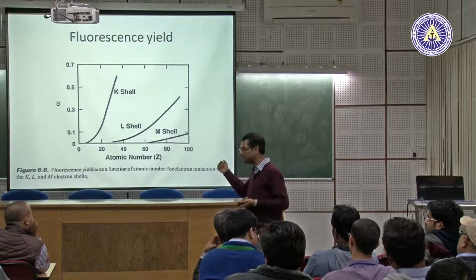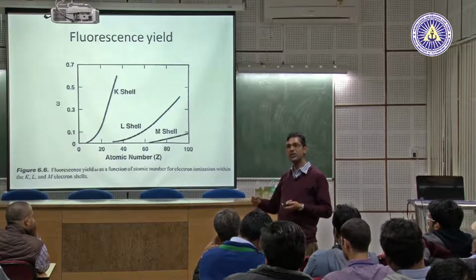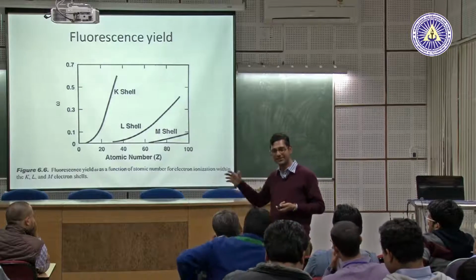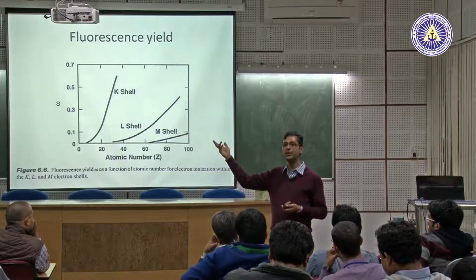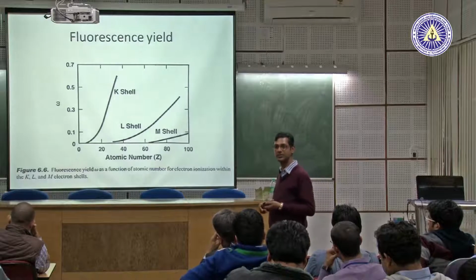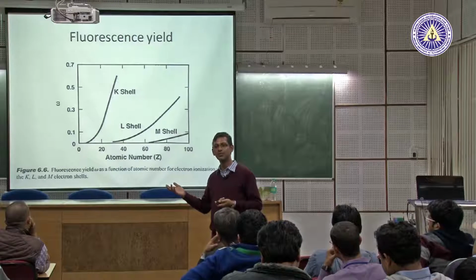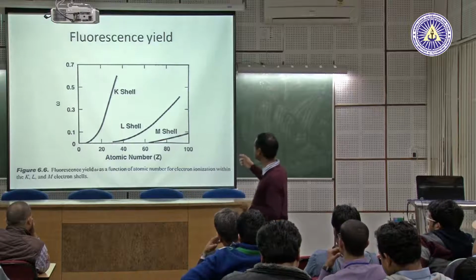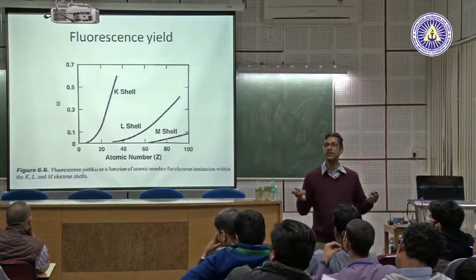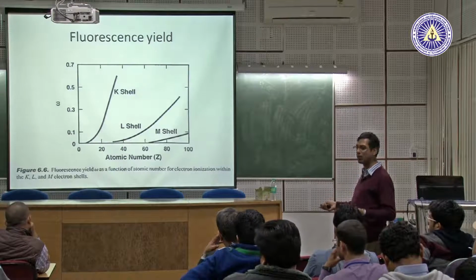So many X-rays get generated, but they will not come out at the same wavelength at which they are formed. They will interact with other atoms, excite their X-rays, and a new X-ray beam will come out. The same thing happens in stainless steel. If you put copper X-rays on a steel sample, it will excite the iron atom X-rays and they come out as a source, right? Same thing happens. So the fluorescent yield for the K shell elements is very large, almost 0.5. On the other hand, the M shell is very low, and the L shell is very low.